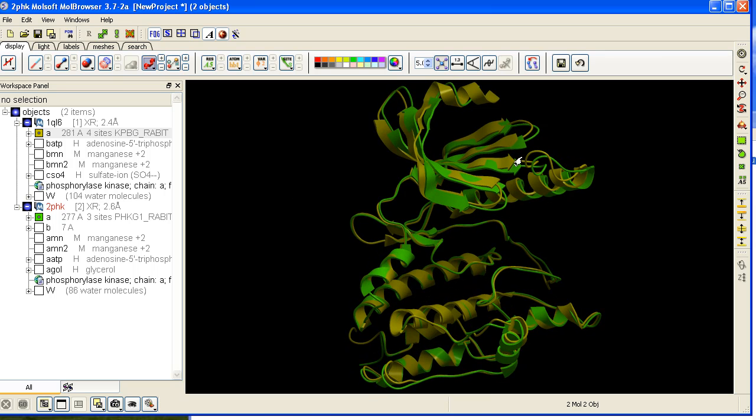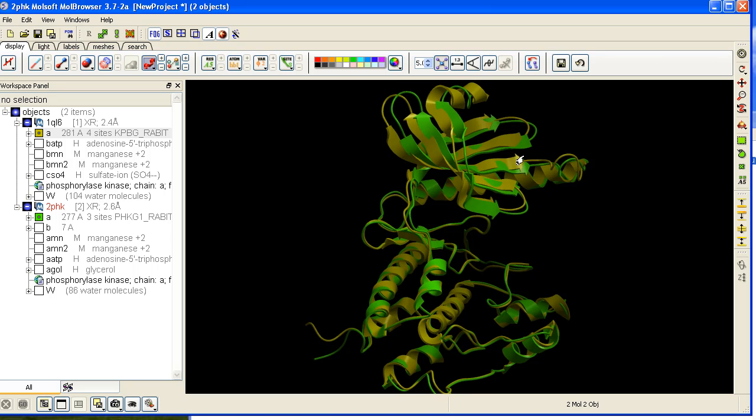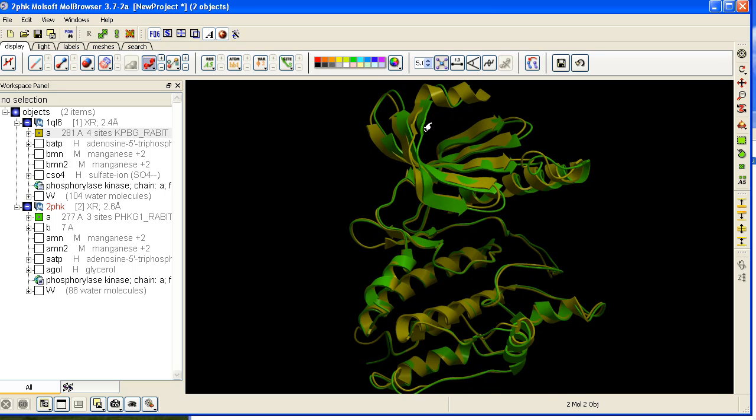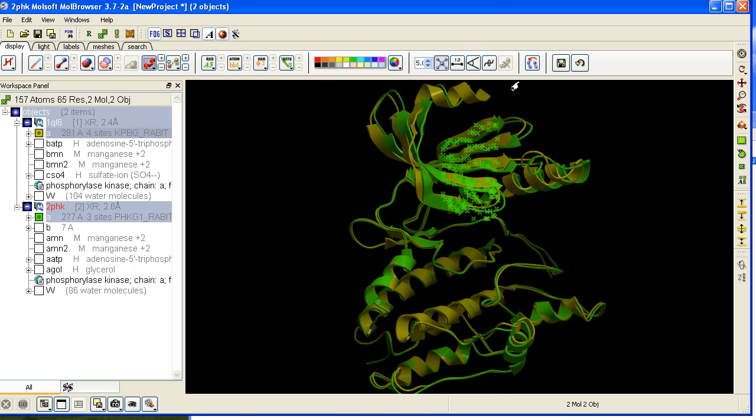You can also right click and drag over any particular region and then superimpose that region and it will superimpose it on the fly.